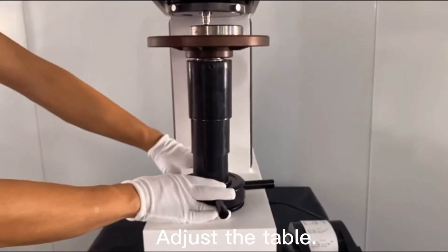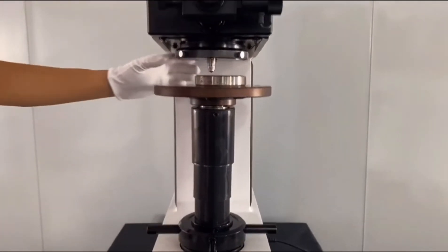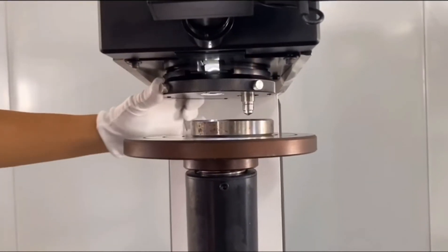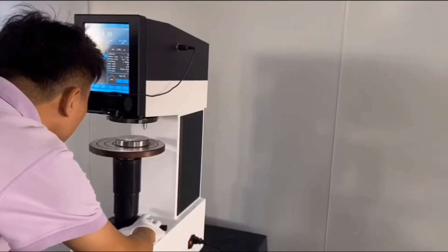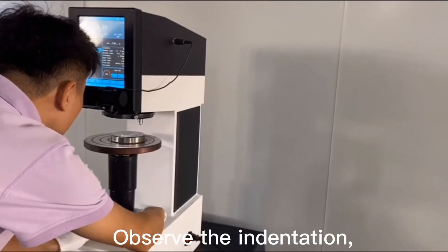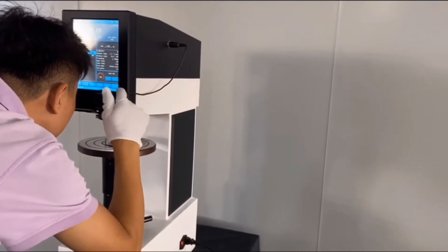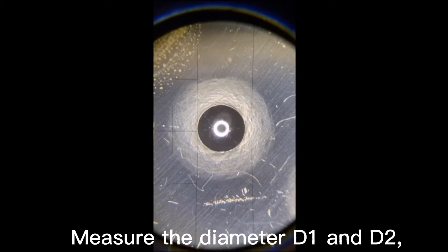Adjust the table. Rotate the turret to the objective lens. Observe the indentation and adjust the focus until clear. Measure the diameter D1 and D2.